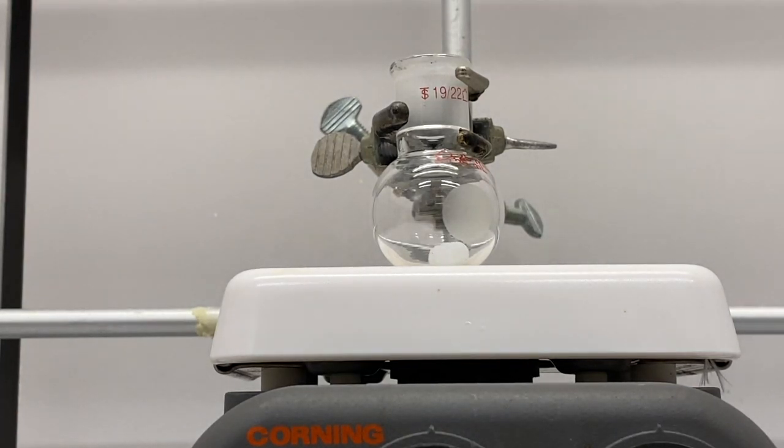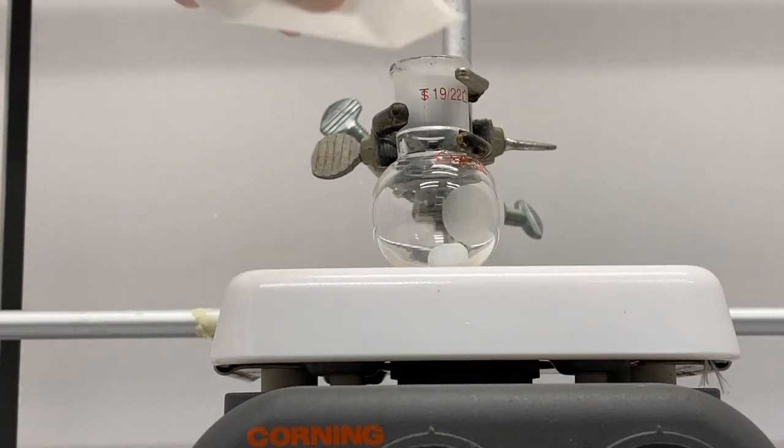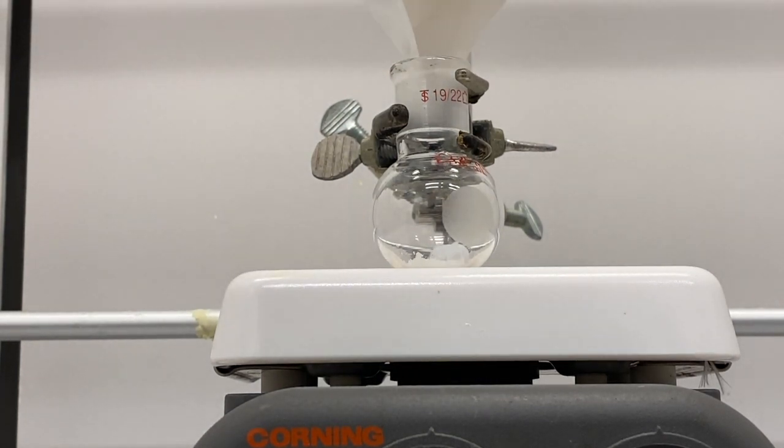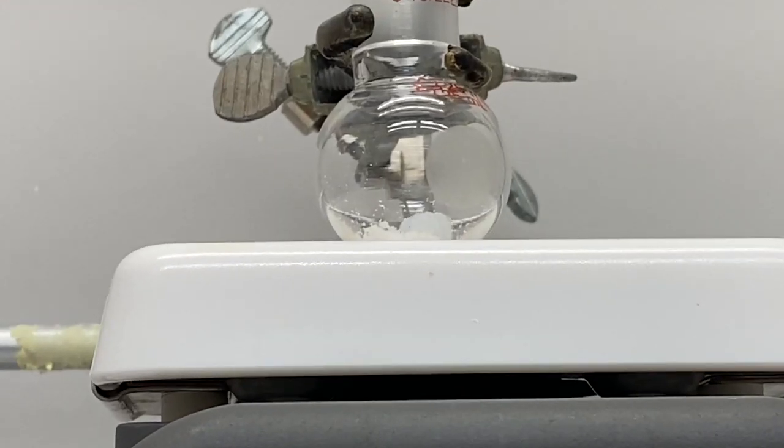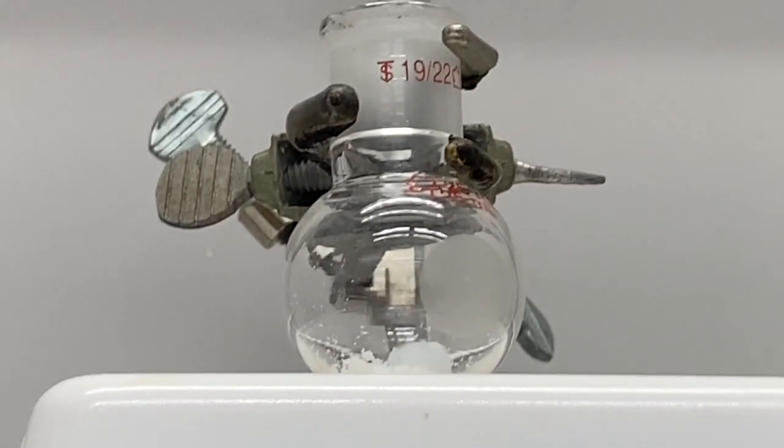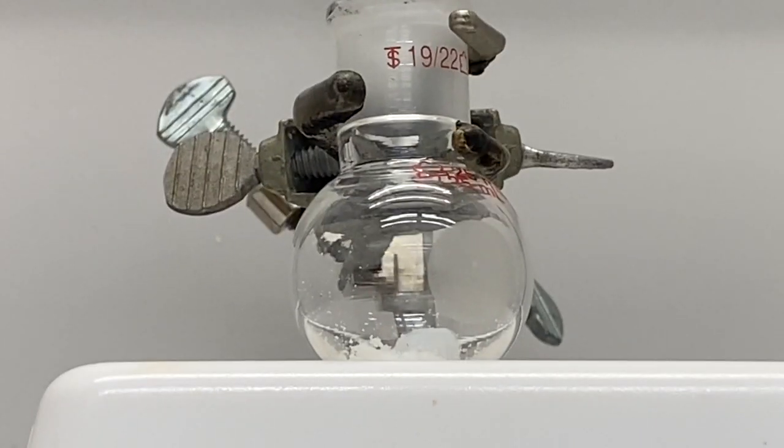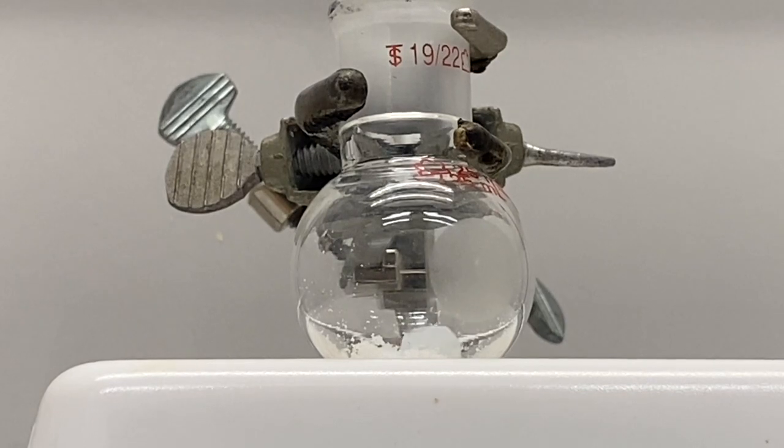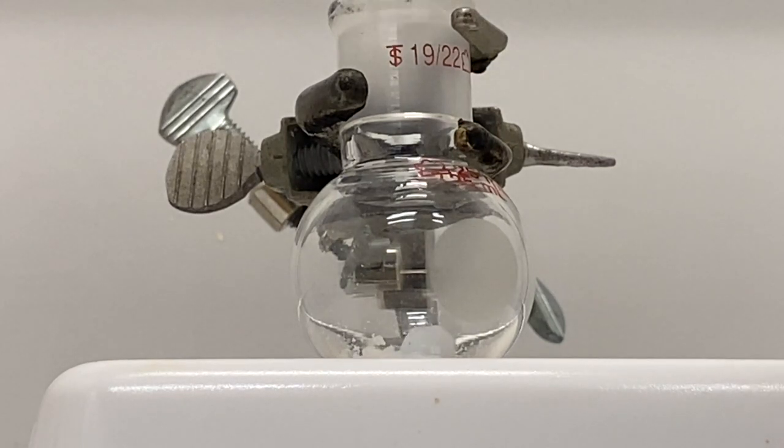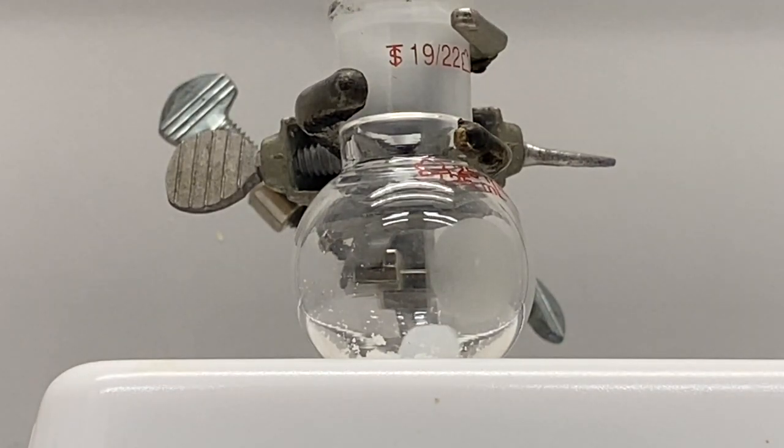So we have our flask over our stir plate and it's stirring. You can see the white stir bar going to the bottom. We're going to add our sodium borohydride. Alright, so we added our sodium borohydride. We're going to take the spatula and spray all the bit of excess with the weight in there.